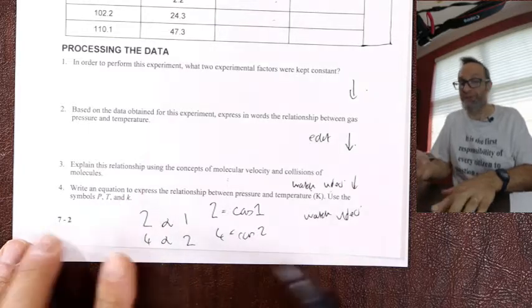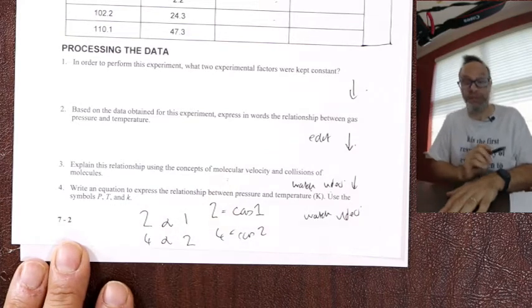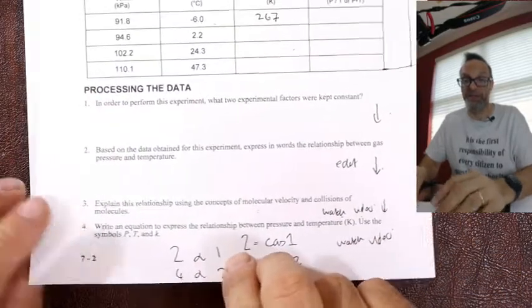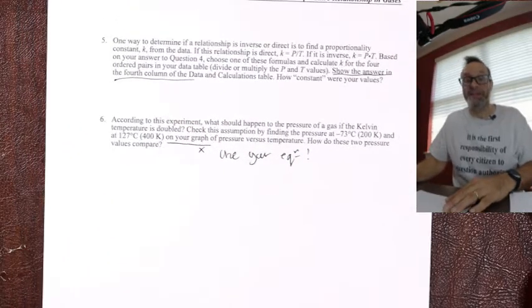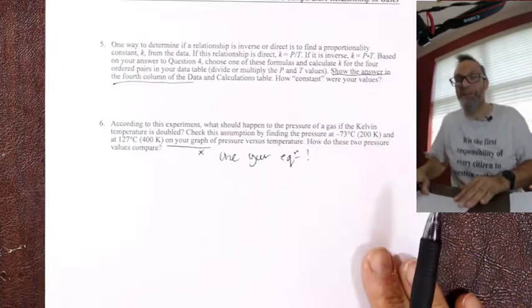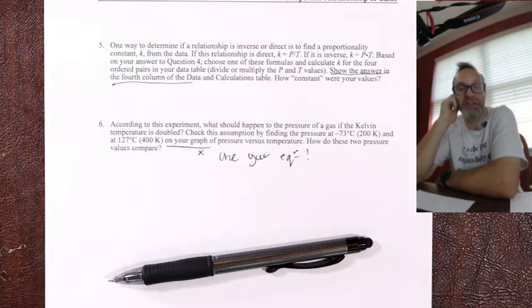So it might be pressure equals, well, I'm not going to tell you the answer. You can write your own relationship in symbols. Look back to that derivation of R, and it's a simpler version of that. Now, here are some details. You have to determine, and we've kind of already told you the answer, if pressure and temperature are a proportional relationship or if they're an inverse relationship.